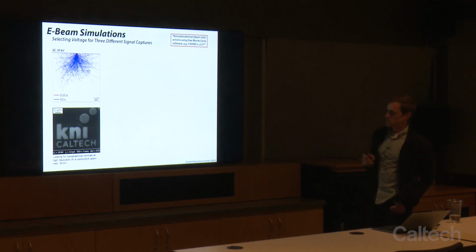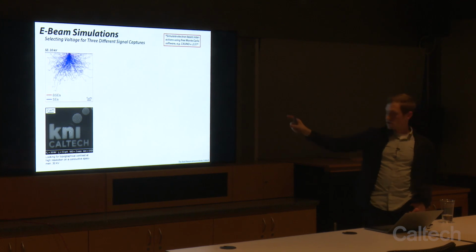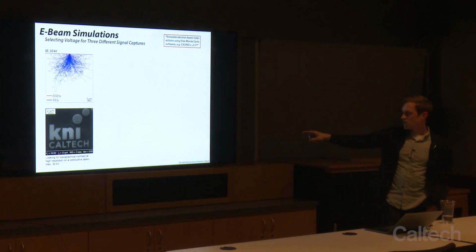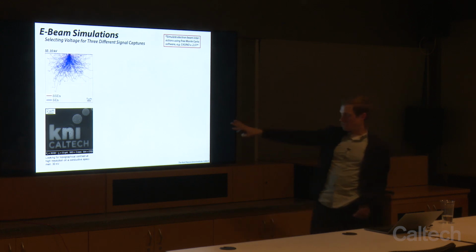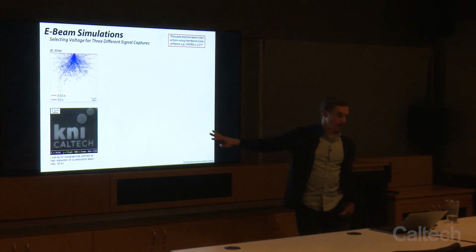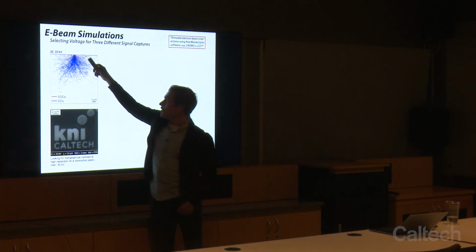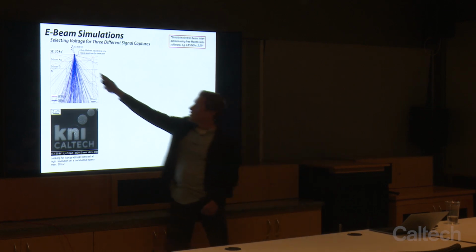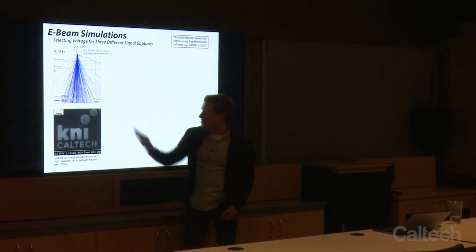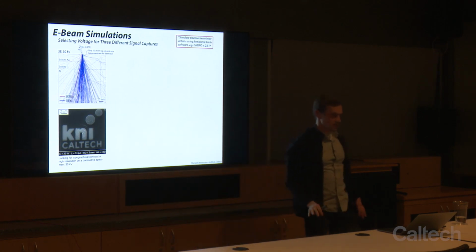Okay, so when I did those images, I chose 30 kV, so the highest voltage, a low current, 50 picoamps, and a small working distance, and I'll talk about working distance. But that's going to give me the best resolution for this topographic image. And even though the interaction volume is really large, the only ones that we actually use for the image, like I told you, are the ones from the top 5-10 nanometers. So it doesn't matter about dumping all that charge into our sample as long as it's conductive.